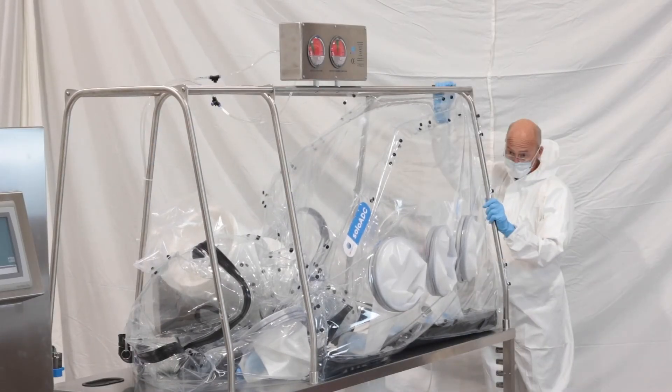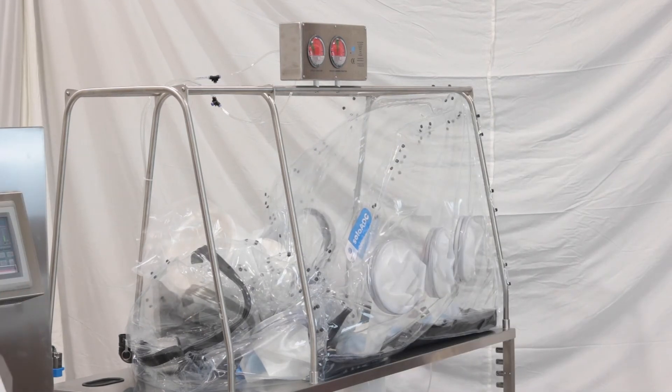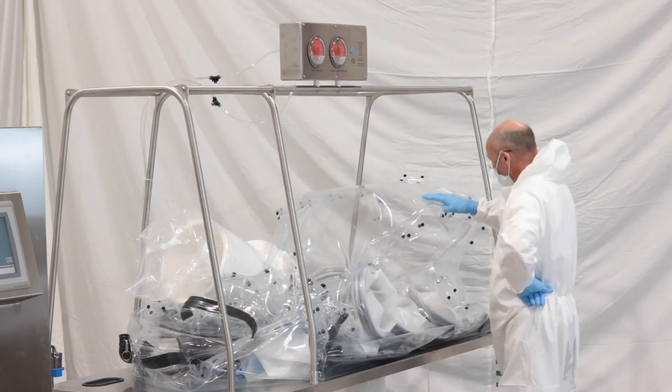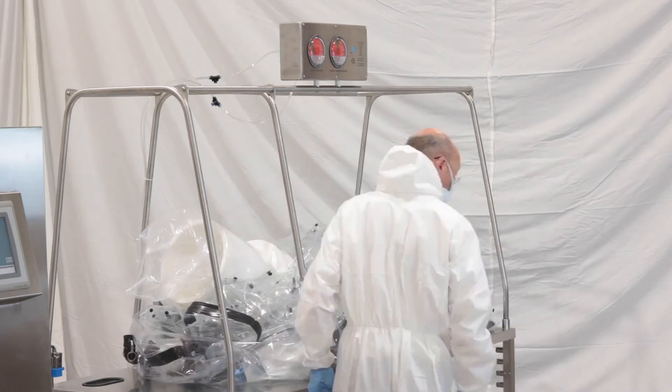Once enough air has been exhausted from the main chamber, you can remove the film from the stainless steel support frame and allow it to lay flat on the table.